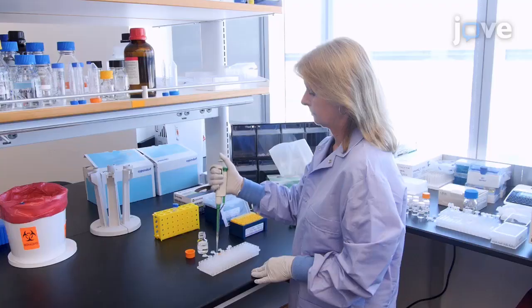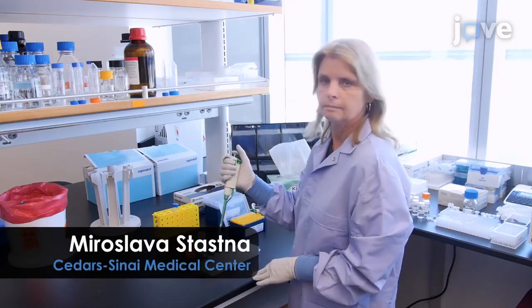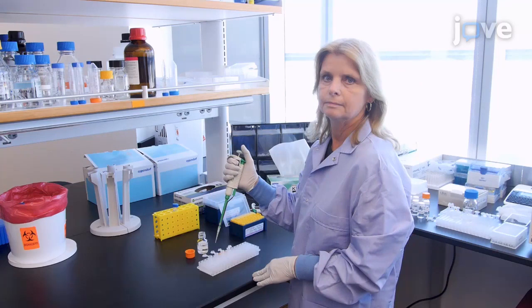This method can provide insight into cardiac responses to stress, but can also be applied to the study of acute responses to stress in other organs. Demonstrating the procedure will be Miroslava Stastna, a project scientist from Jennifer Van Eyck's laboratory.